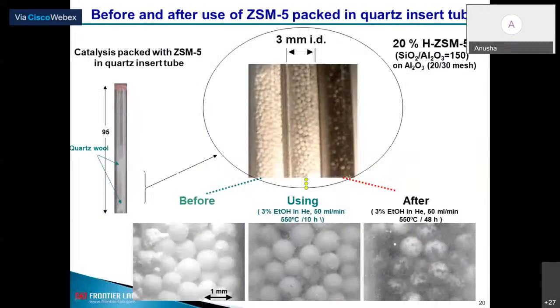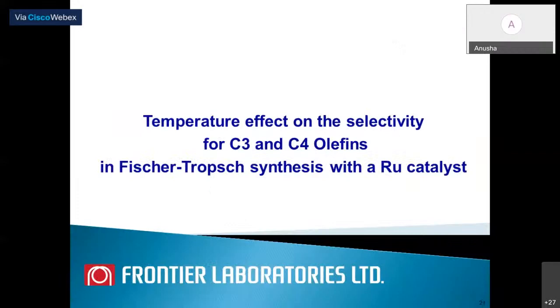Next I'm going to talk about Fischer-Tropsch synthesis using the RU catalyst.